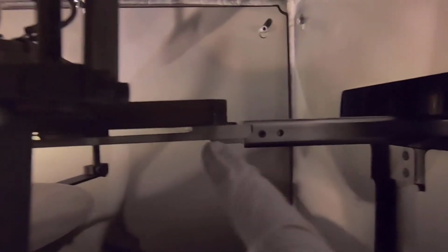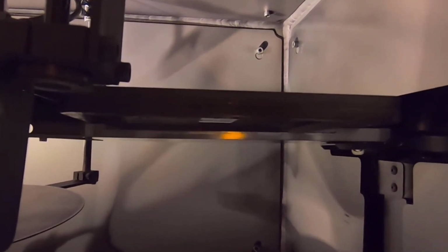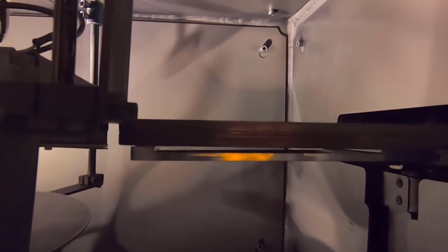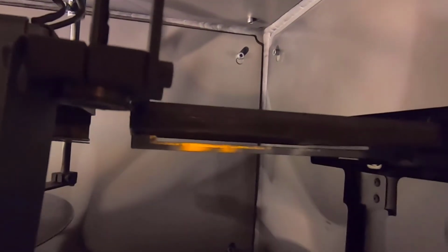As you're doing so, watch this end and watch the other end to make sure there's no obvious gaps or loose attachment of the substrate holder and the paddle. You don't want this thing rocking and rolling or wobbling back and forth, because if you lose it somewhere in the gate valve or lose it here, catastrophic things can happen. So I don't want to see any gaps here or here, and I want to see that I've slid all the way out without scraping or crashing into this piece.